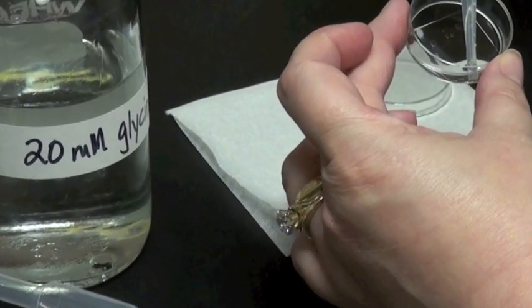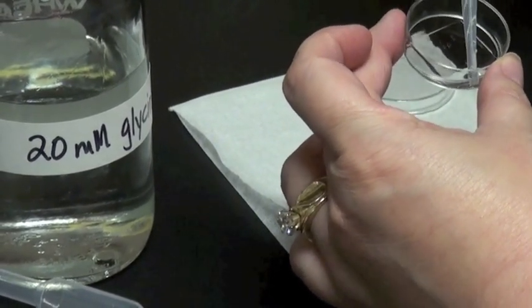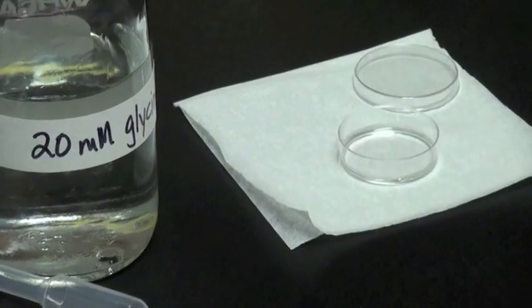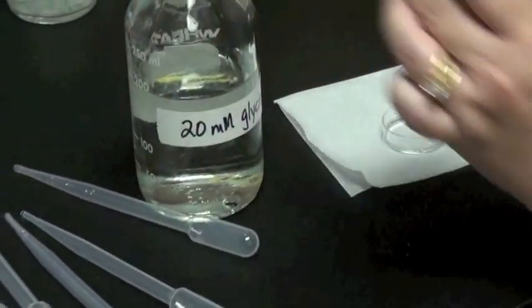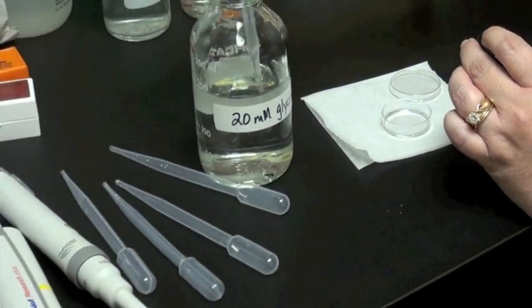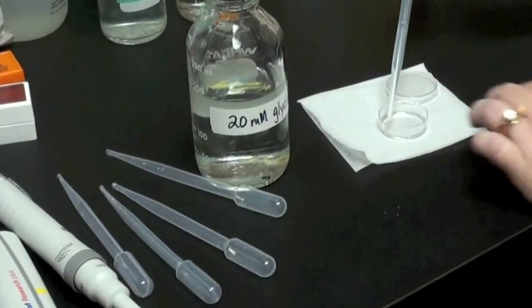In this case I'm using 0.1% Triton X-100 in a 1X PBS solution. I'll add this. Again, I'm expelling the liquid down the side of the petri dish, making sure my cover slip is completely covered.